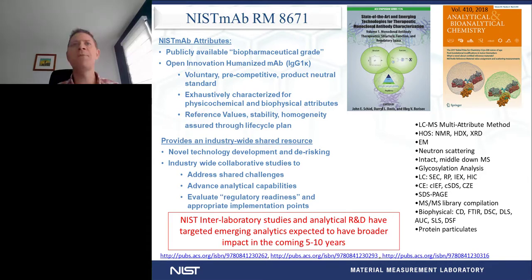analytical methods. We then moved forward from that exhaustive characterization, and we did a series of analytical qualifications. So essentially evaluating the precision, robustness, and quality of each of those analytical assays that could inform on the stability or purity of the molecule. This is highlighted in the analytical and bioanalytical chemistry cover on the right-hand side.